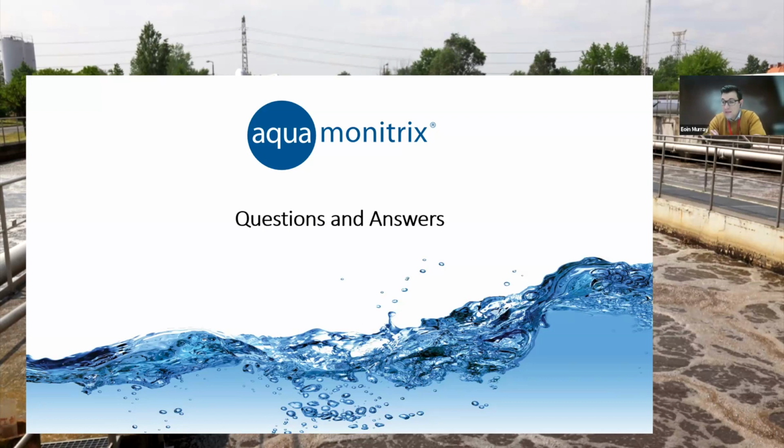We're working through our development cycle, and we're currently in the process of deploying and demonstrating on site. But absolutely, the ambition is to have nitrite, nitrate, and ammonia within a single system. Very important system, and we're working hard to deliver that, most certainly.